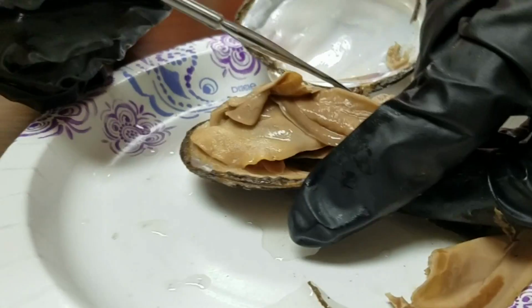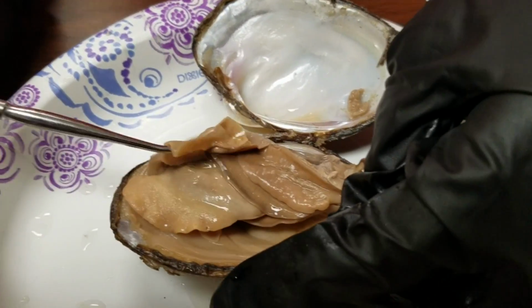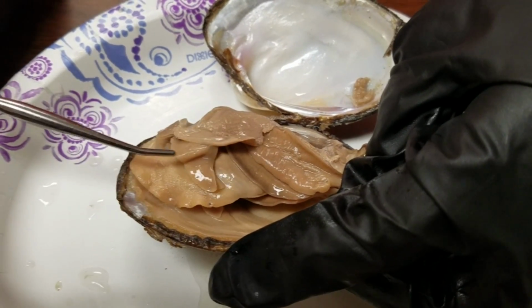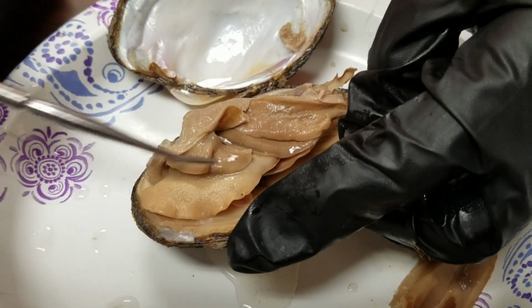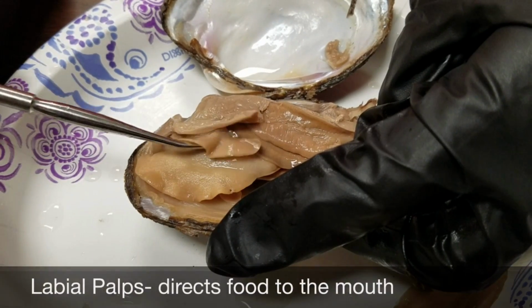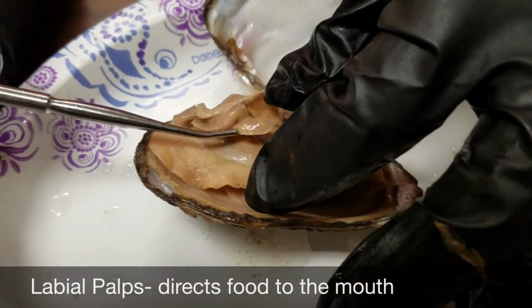So visceral mass, gills, muscular foot. You'll also find these two things that look sort of like elf shoes to me. See, look, there's the little toes. But these are called the labial palps. Labia means lips, so these are sort of like the clam's mouth.